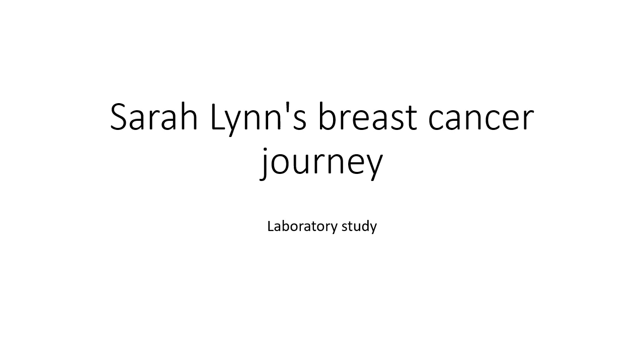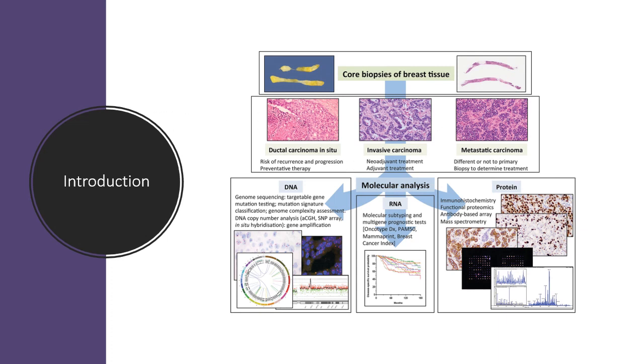The following video will describe how the lab processes a breast tissue biopsy before handing it to the pathologist for examination. After a biopsy, a breast tissue then is sent to the lab for pathology examination. In case of malignancies, further molecular and proteomics tests will be performed.